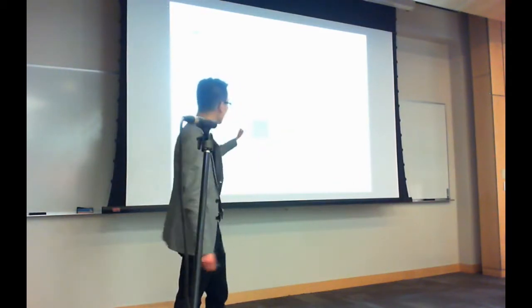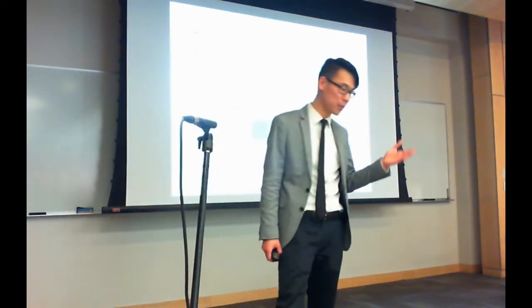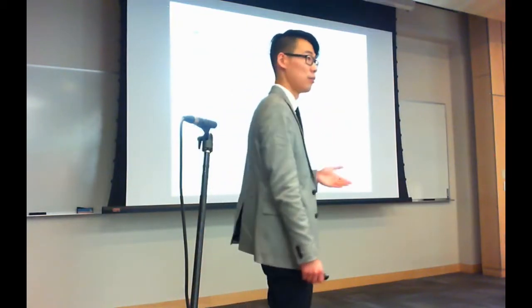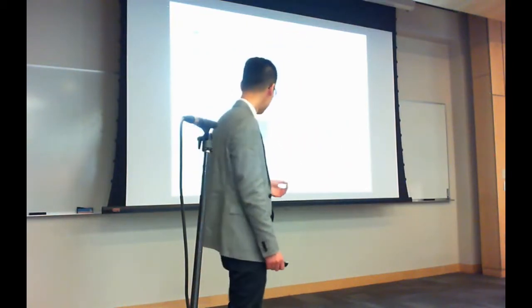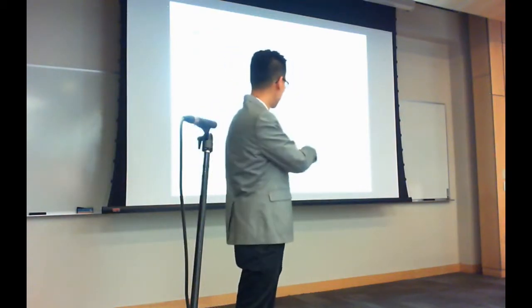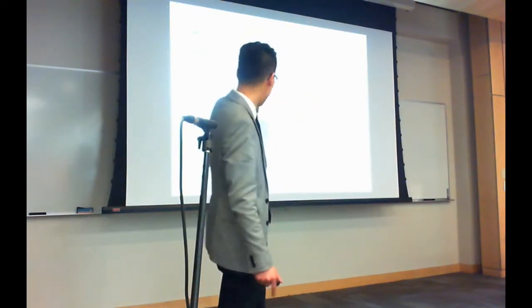So the library that we end up with is about 2.1 million precursors, but only 2,000 of them are estimated to be wrong. And we also apply a 1% protein FDR. So we reduce it from 28% to 0.1%, but at a sensitivity loss of about half.